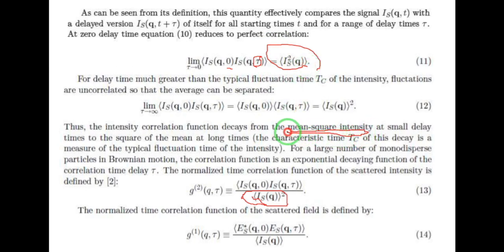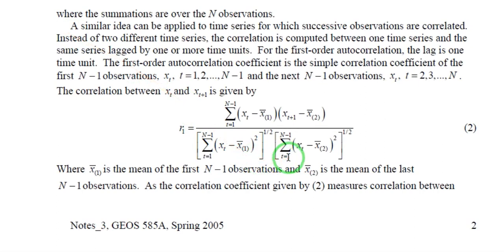This is really important. Let me show you in another form. Well, I told you about the important assumption that we moved the reference on the mean value, so the mean value became 0. So neglect this one and neglect this one as well.